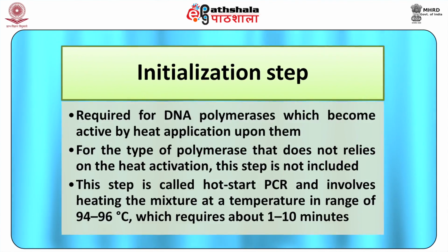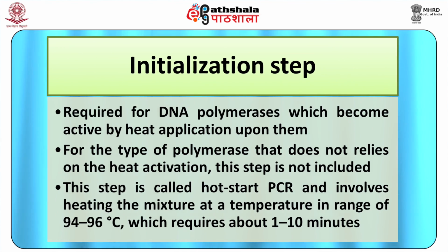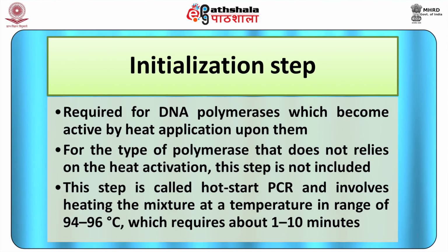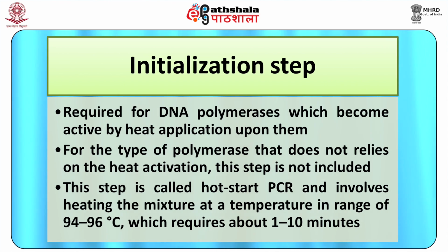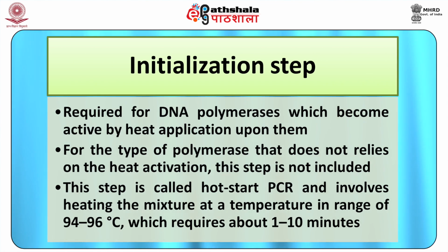Let us now talk about the initialization step. This initial step is required for DNA polymerase, which becomes active by heat application. For the type of polymerase that does not rely on heat activation, this step is not included. This step is called hot start PCR and involves heating the mixture at a temperature in the range of 94 to 96 degrees Celsius, which requires 1 to 10 minutes.